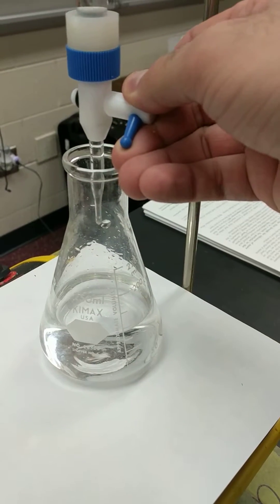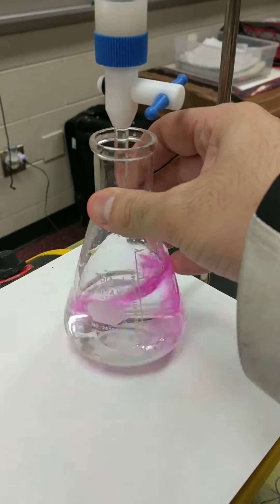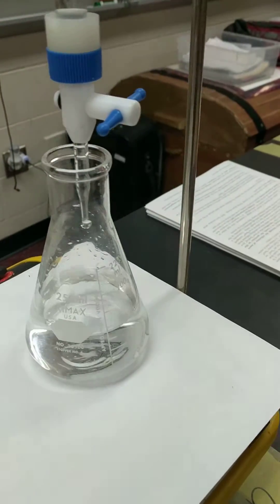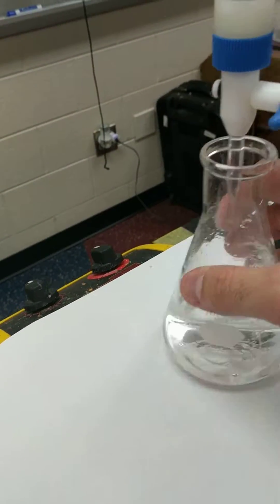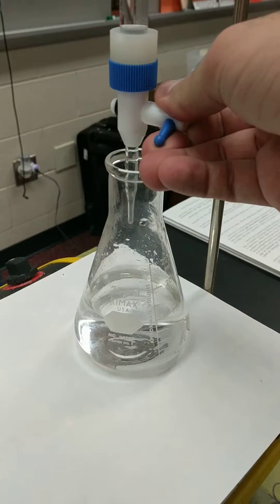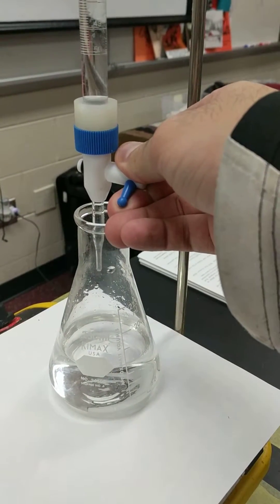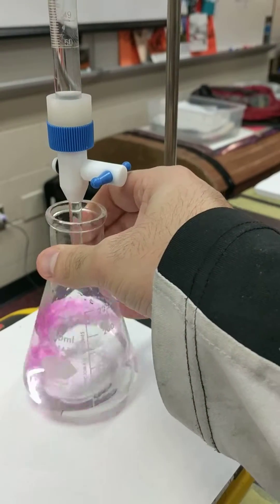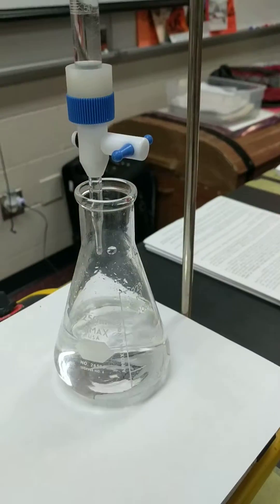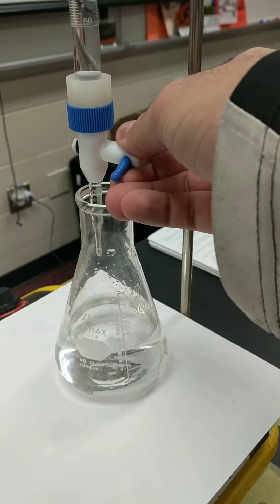So I want to drop it slowly, slowly, slowly. Color still goes away. I guarantee like my next drop is probably going to do it, right? Or very close to it. So I'm going to do one more drop. And oh, that is so close. Did you see how long that pink color was?